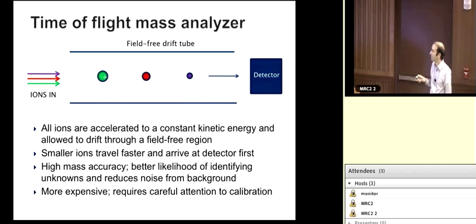The end result of this is you get a very high resolution mass spectrometer, and this is similar to an FT-ICR, which is sort of the original Fourier transform type of mass spec. But the output is you get even higher resolution. So 10,000 is pretty good mass resolution. This is a moderate resolution for a time of flight instrument. You can do 10 or 20 times better than that on an Orbitrap. So you can sometimes even distinguish things that were previously inseparable.